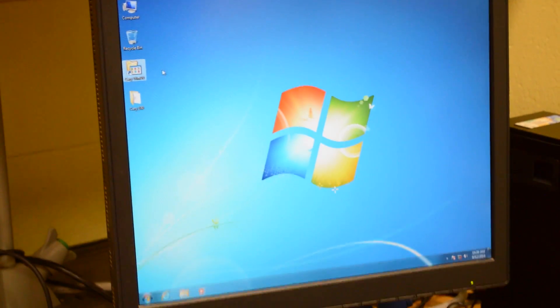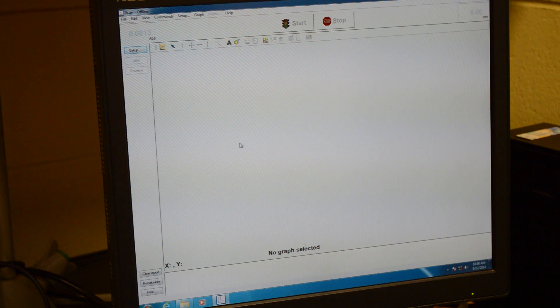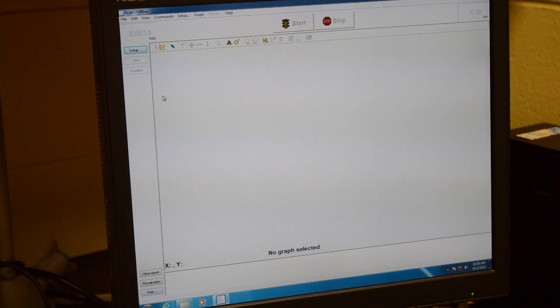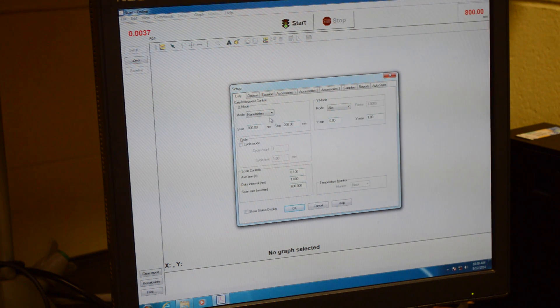Cary UV, which is right here, and then you can choose scan. To set up the proper parameters that you need for this program, you're going to press setup here. We're doing an example of a visible trial here. We're going to change the wavelength so the X mode to start at 900 nanometers and stop at 360 nanometers.